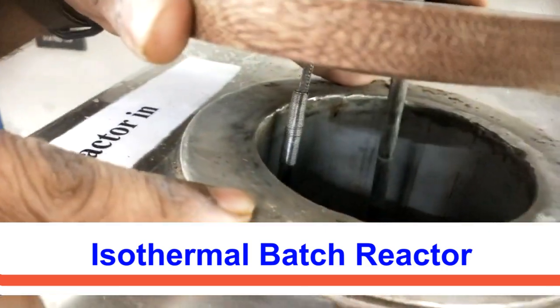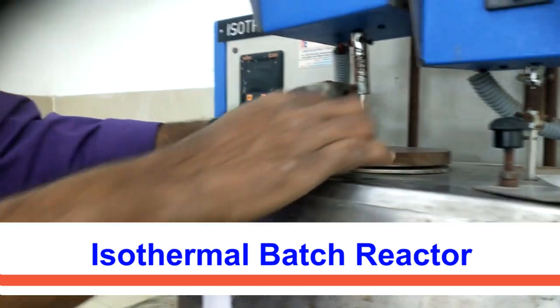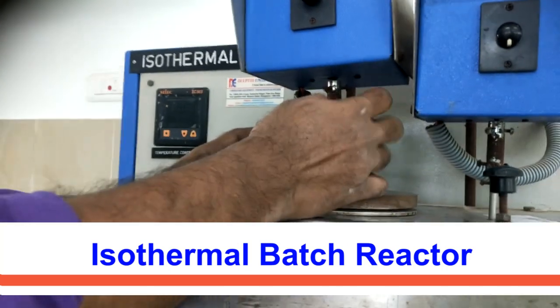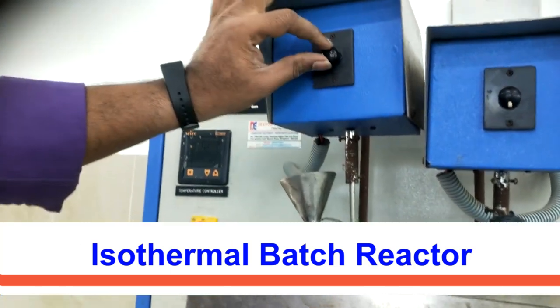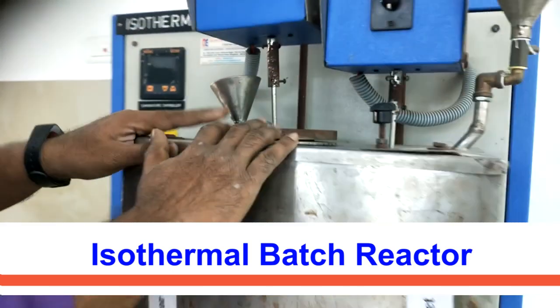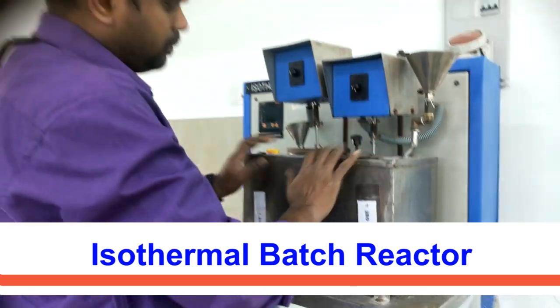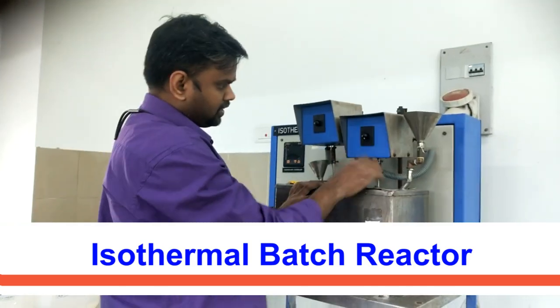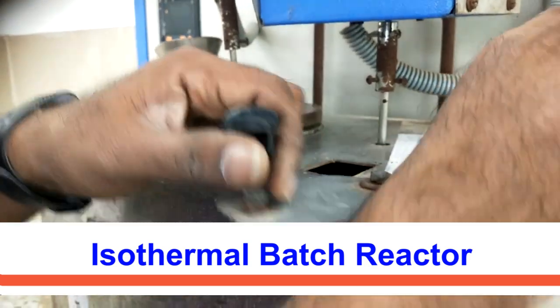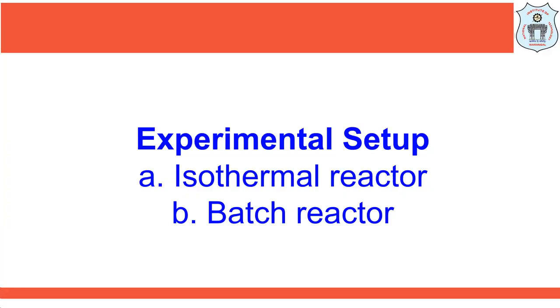So this is the reaction vessel. And we have feeding. For feeding, we have a funnel setup, and we have an agitator. So the blade will be rotating, so we can adjust the speed here. Then, for maintaining the isothermal conditions, we have a cooling jacket. In the cooling jacket, we will be mixing the cooling water also using another agitator. So you can check the level of water here. To fill the water into this cooling jacket, we will make use of this.